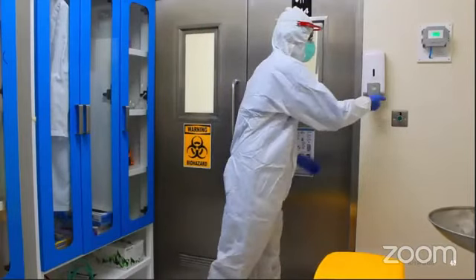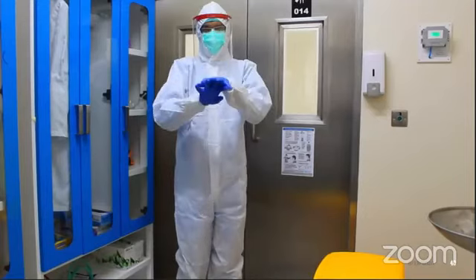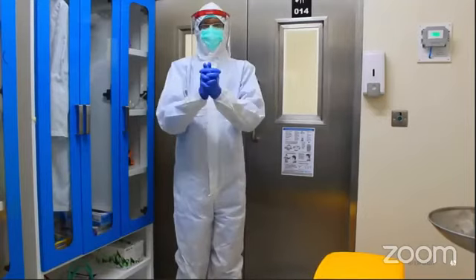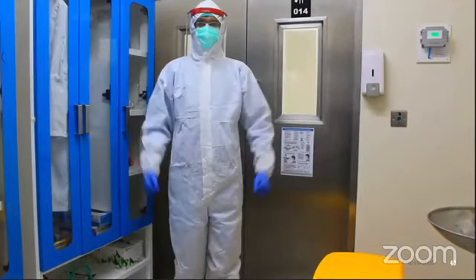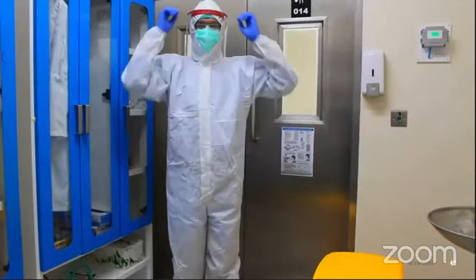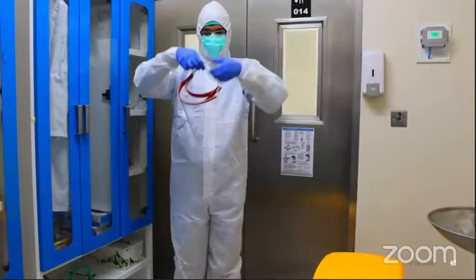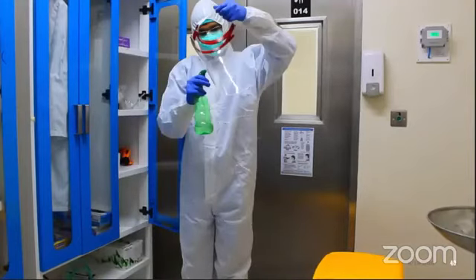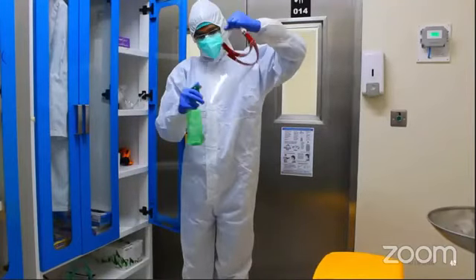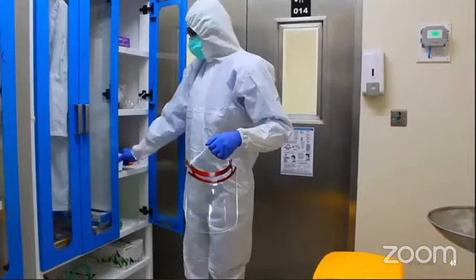Again disinfect the inner gloves. Remove the face shield by lifting the back strap over the head and pulling it away carefully. Avoid touching the front surface of the screen.